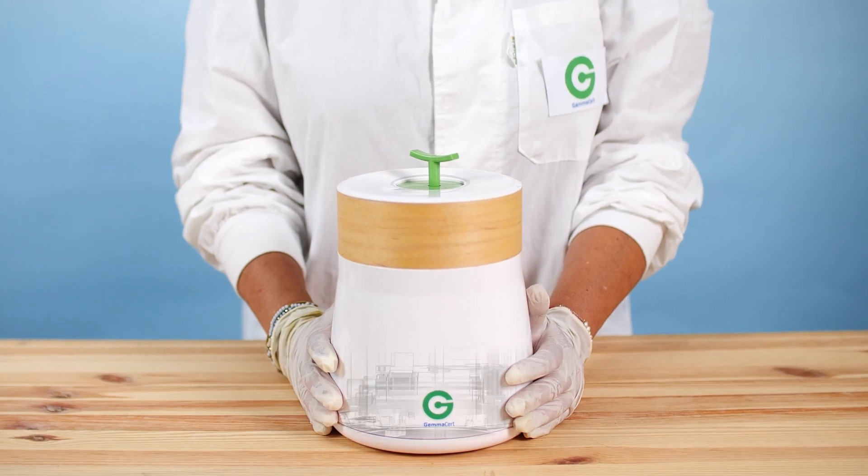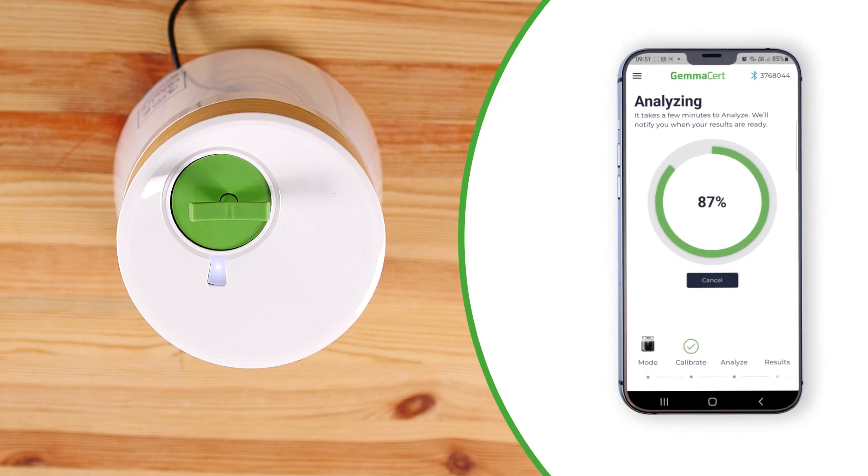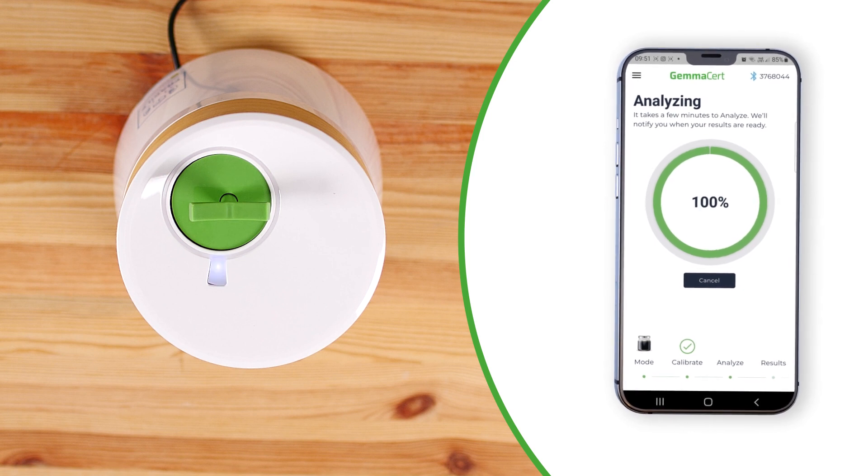If you are calibrating for the first time after turning on the device, there is a warm-up period. Calibration is complete when the power button turns to SETI Blue and you hear a beep.